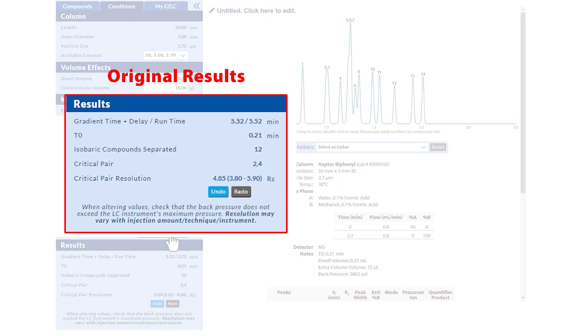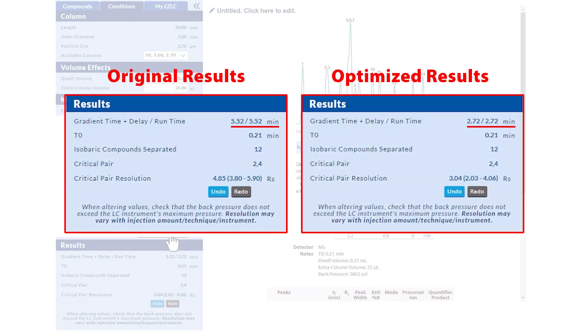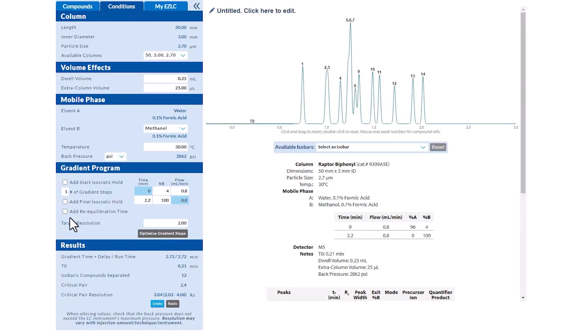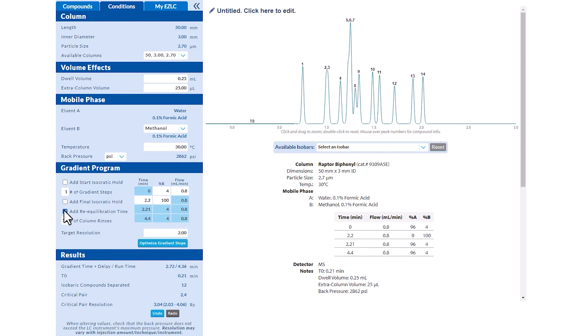Thanks to our optimizations, we've shortened our runtime by almost three minutes and we did it in seconds without using an instrument. Finally, we can add a re-equilibration step which will get the column back to the starting conditions for the next run.